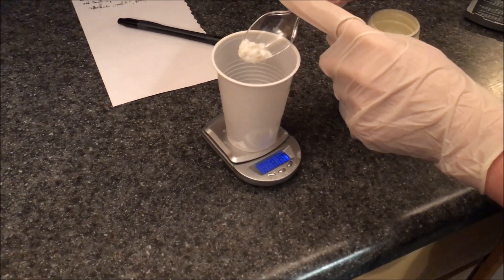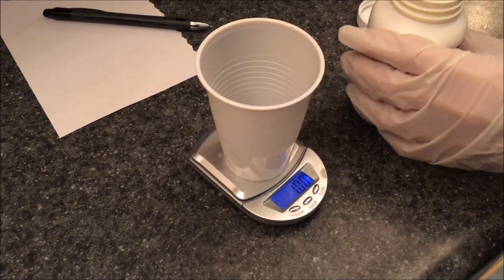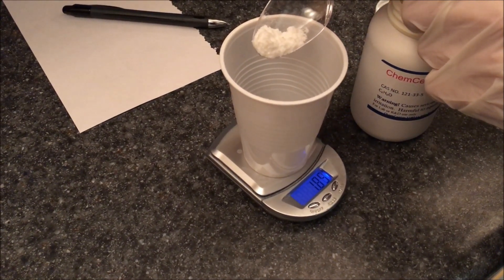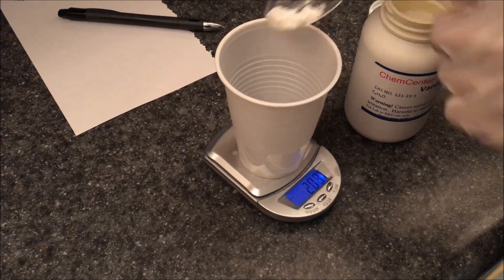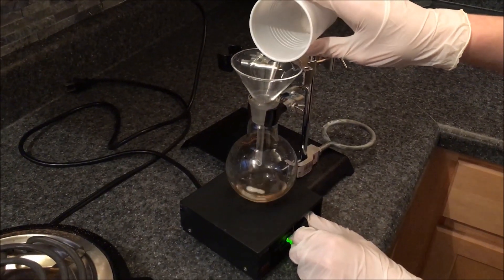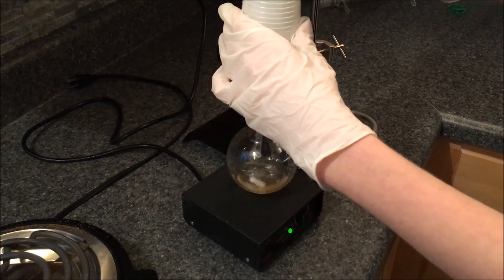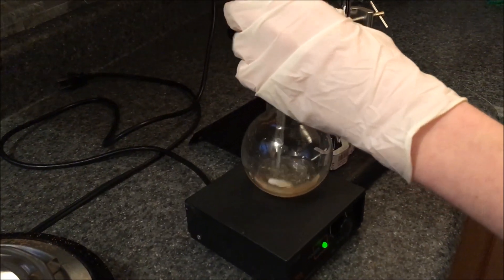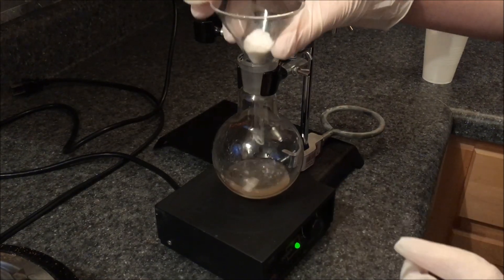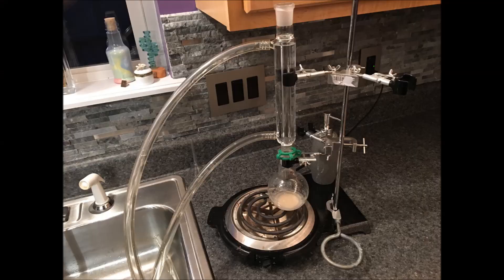Then weigh out 2 grams of vanillin and add it to the same flask containing the previous ingredients. My vanillin got a little stuck in the funnel, so make sure to get it all out and into the flask. The solution will be cloudy from the vanillin, but that is okay because it will clear up later.